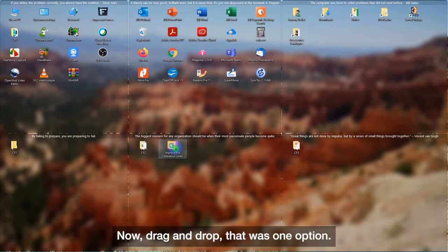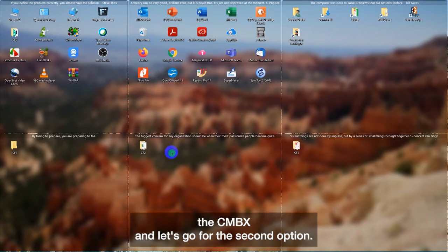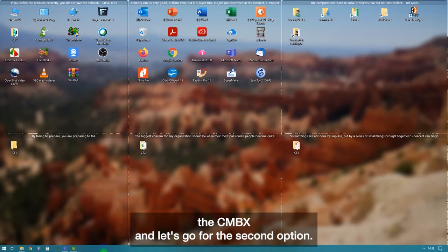Now, drag and drop. That was one option. Now, let's delete the CMBX and let's go for the second option. The second option is as easy.